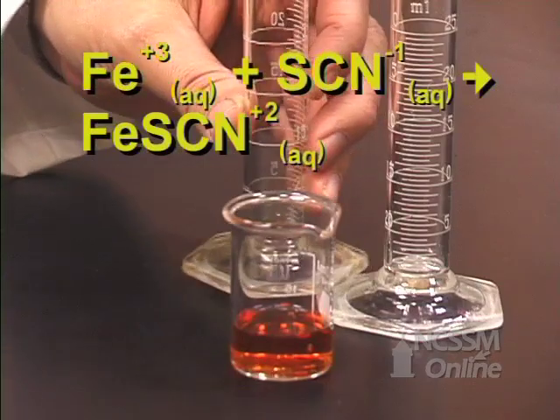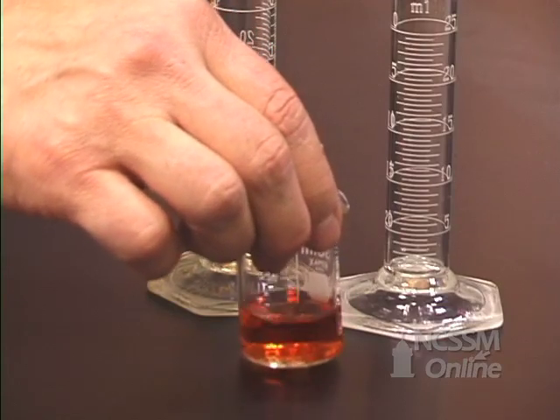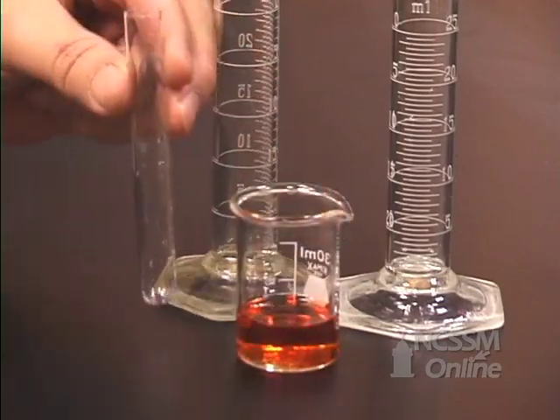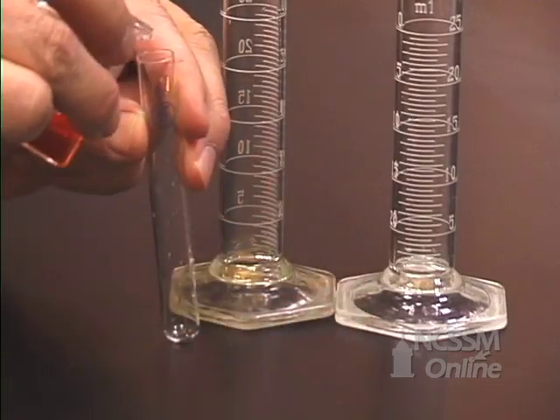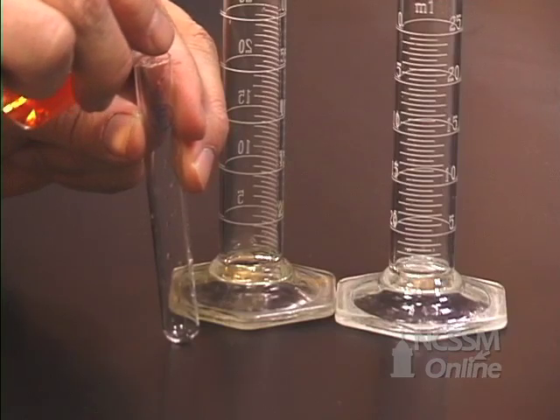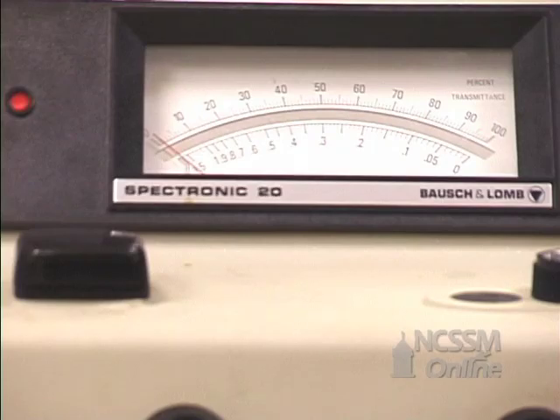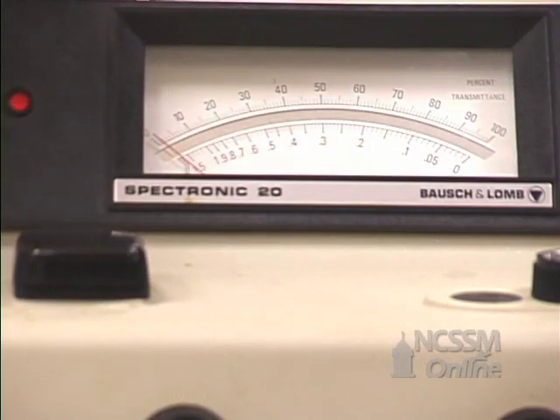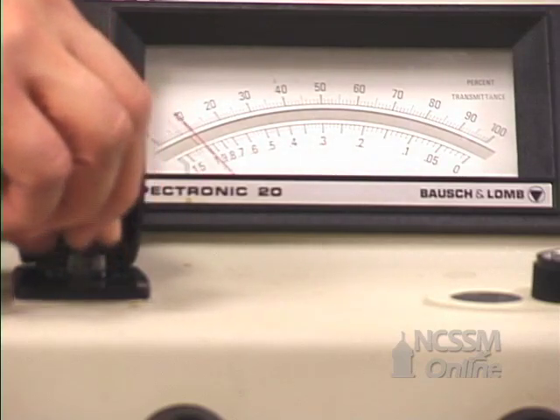Swirl them so they mix and transfer your solution to the cuvette. You will then read the percent transmittance of each of the equilibrium mixtures that you have prepared.